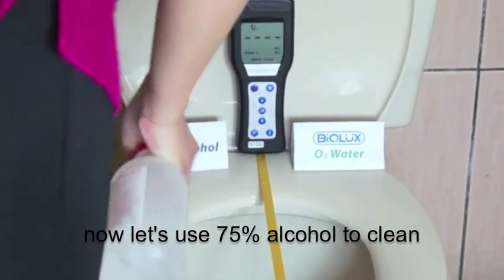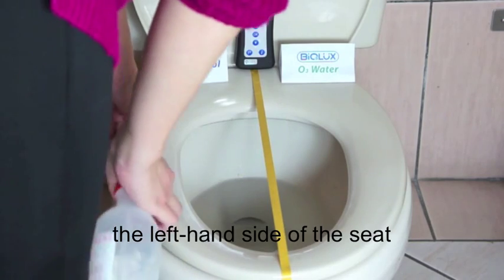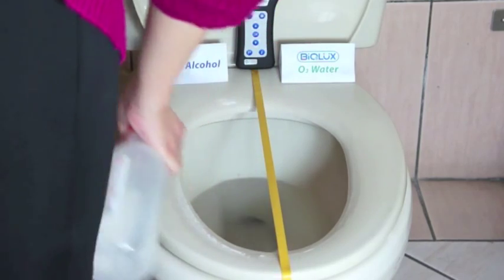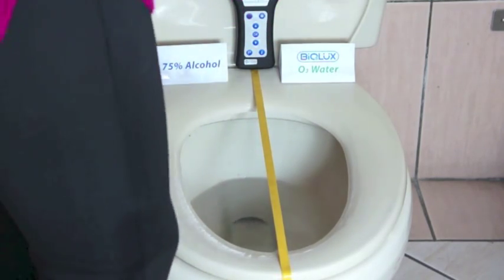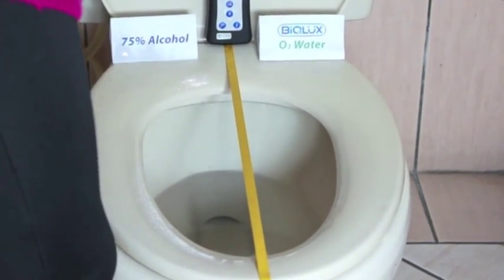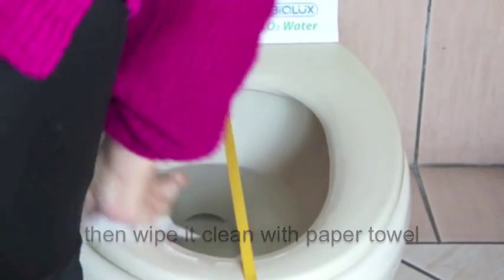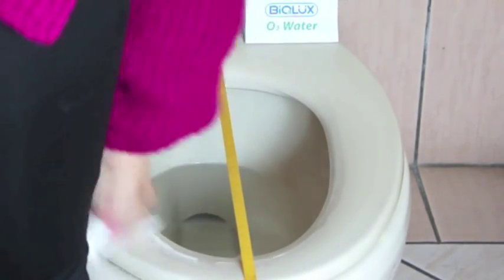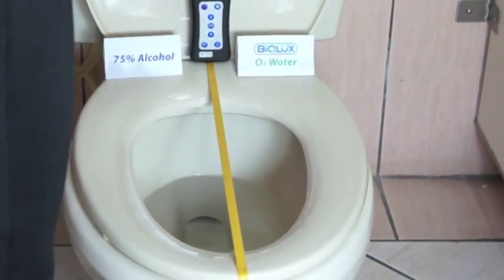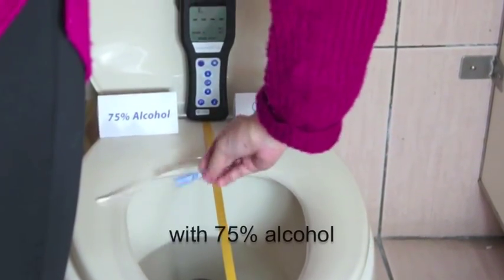Now let's use 75% alcohol to clean the left-hand side of the seat, then wipe it clean with paper towel. Now we collect a sample from the side just cleaned with 75% alcohol.